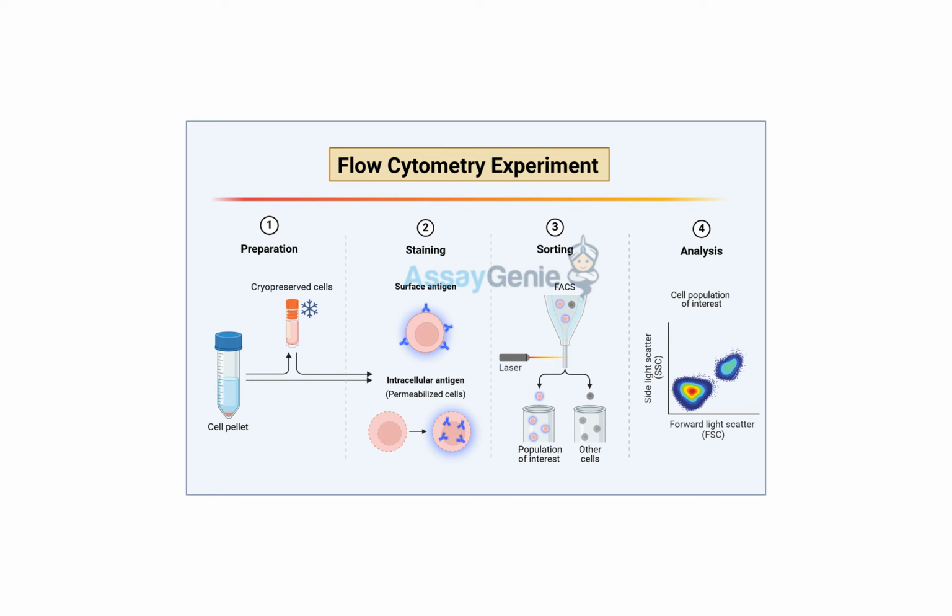Okay, so imagine this. You're trying to study a specific protein deep inside a cell. The first challenge is, how do you even get access to that protein? You can't just crack the cell open like an egg. Exactly. They're very delicate. And that's where this idea of permeabilization comes in. We need to make the cell membrane permeable to antibodies so that they can get inside the cell. So the antibodies are like our little detectives. Yes, but they need a way in. Okay, so how do we do that?